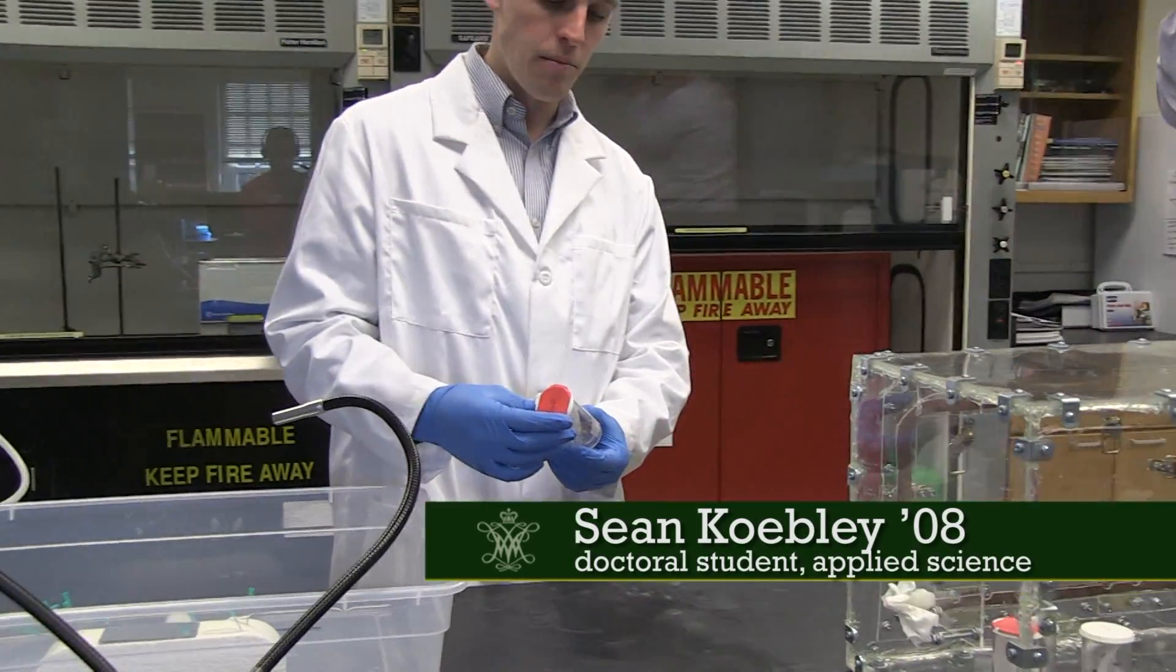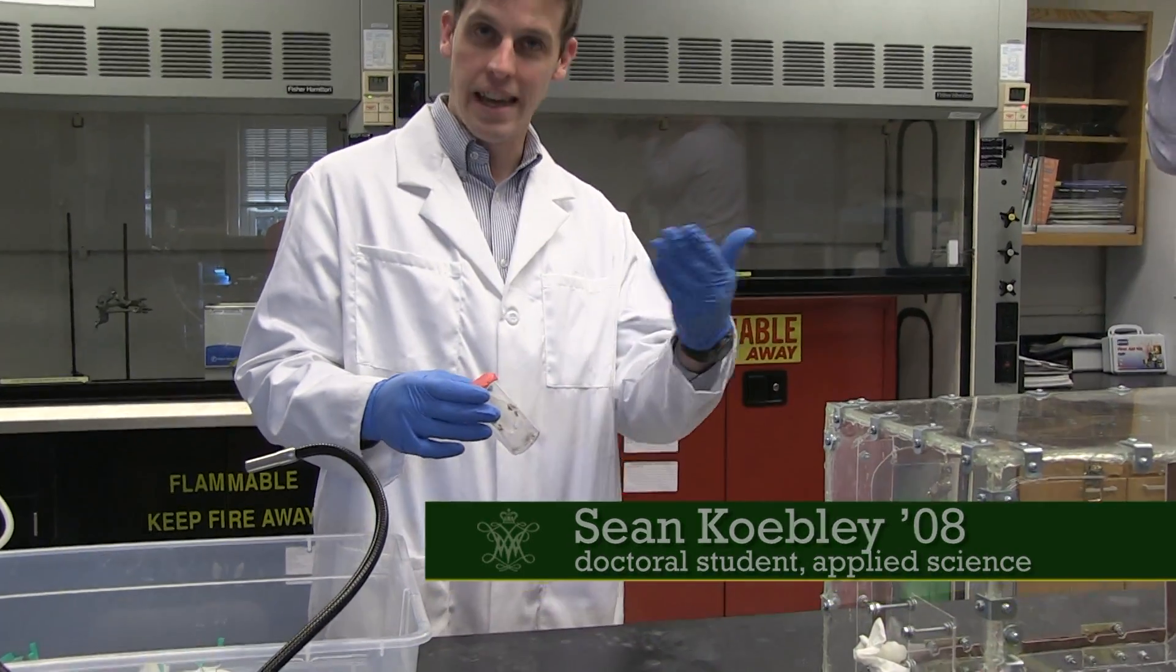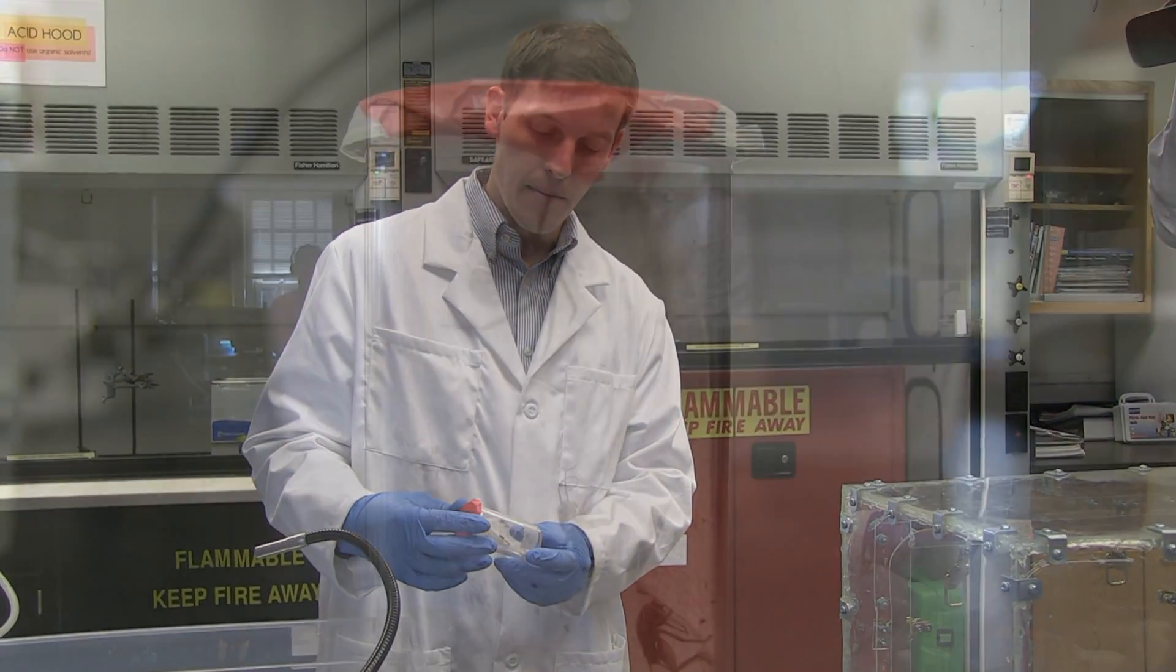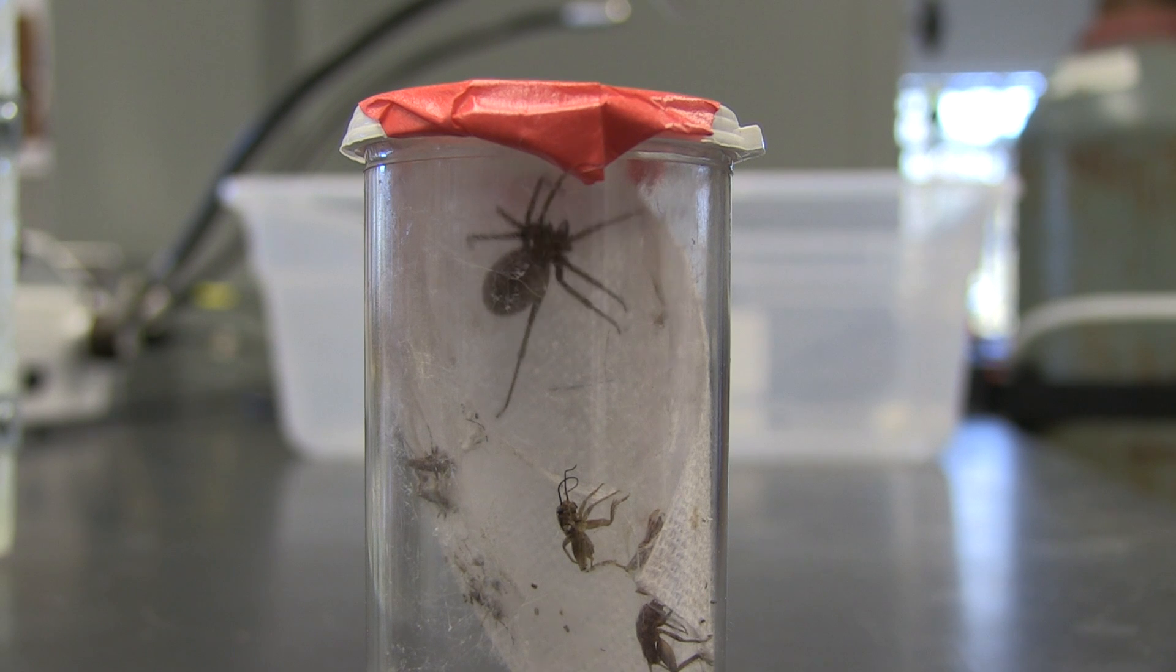These are a South American variety of brown recluse. They're called Loxosceles laeta, their scientific name. You can see they're quite small, maybe the size of a quarter.